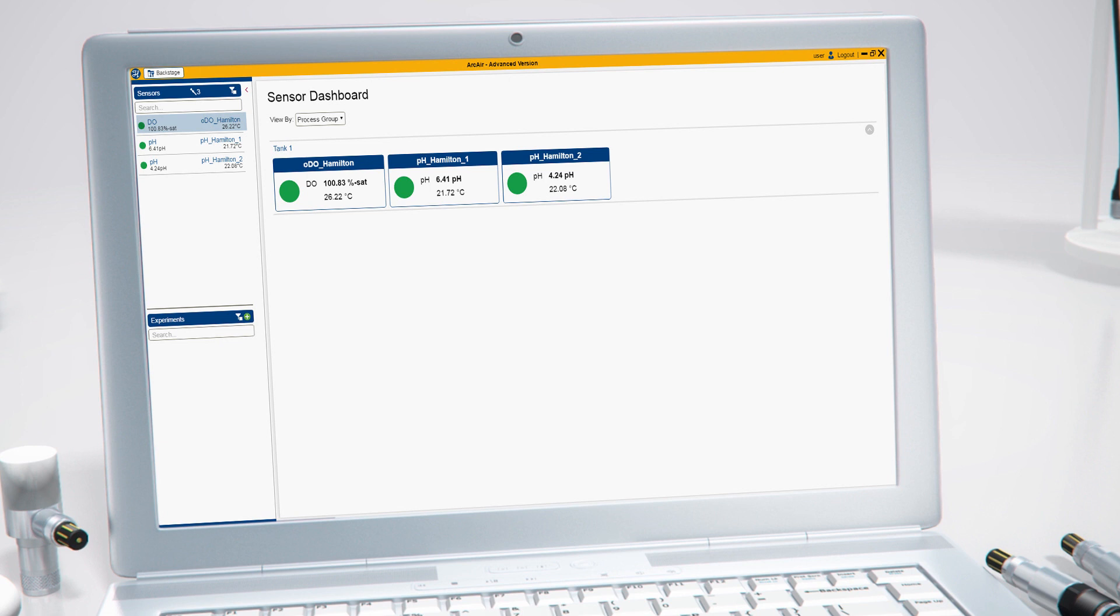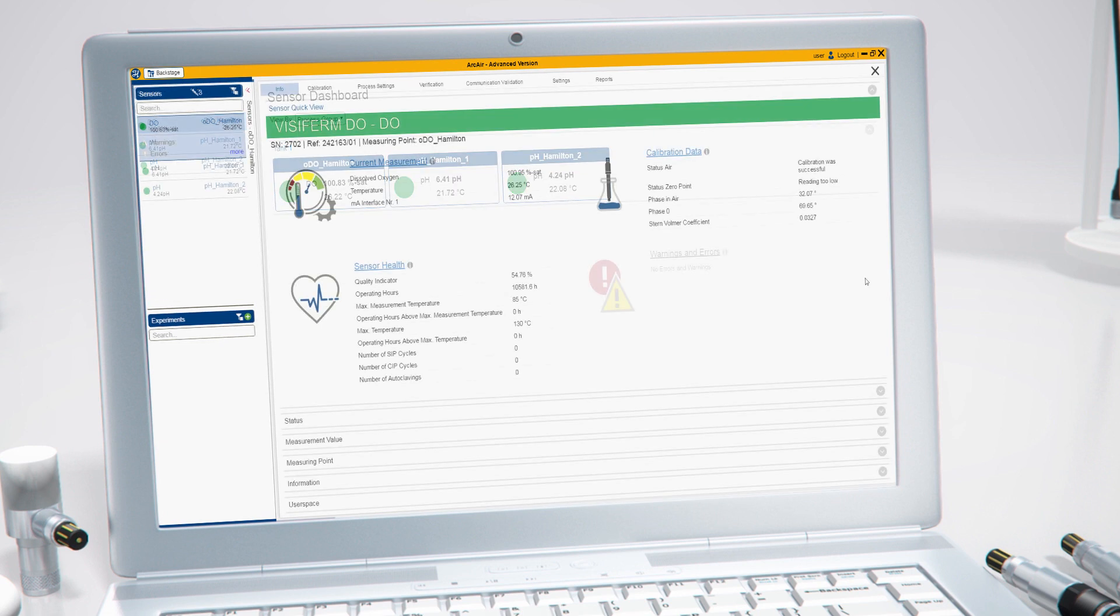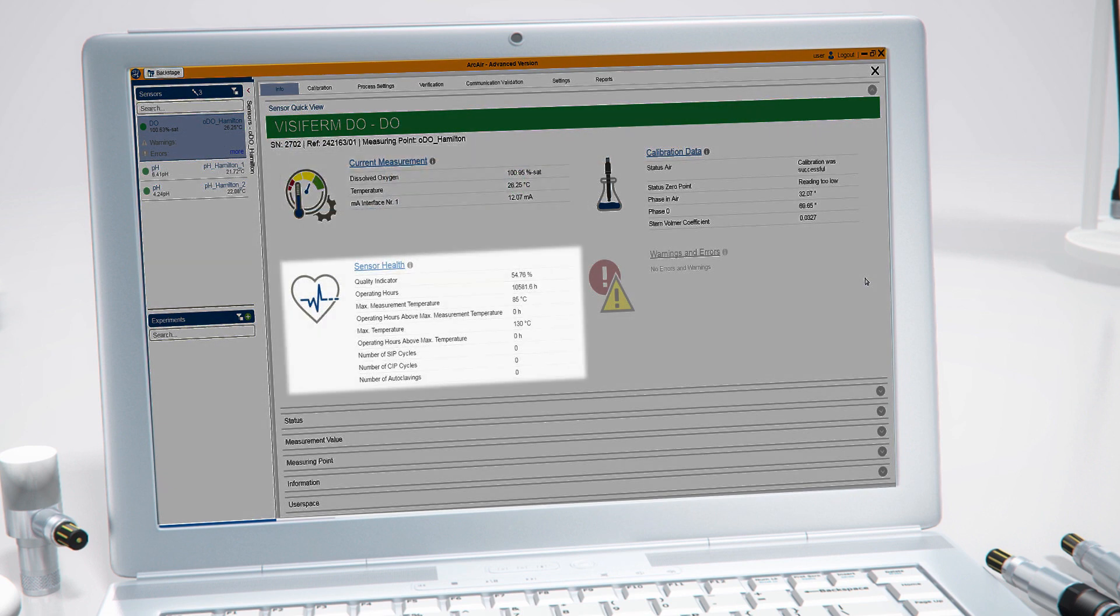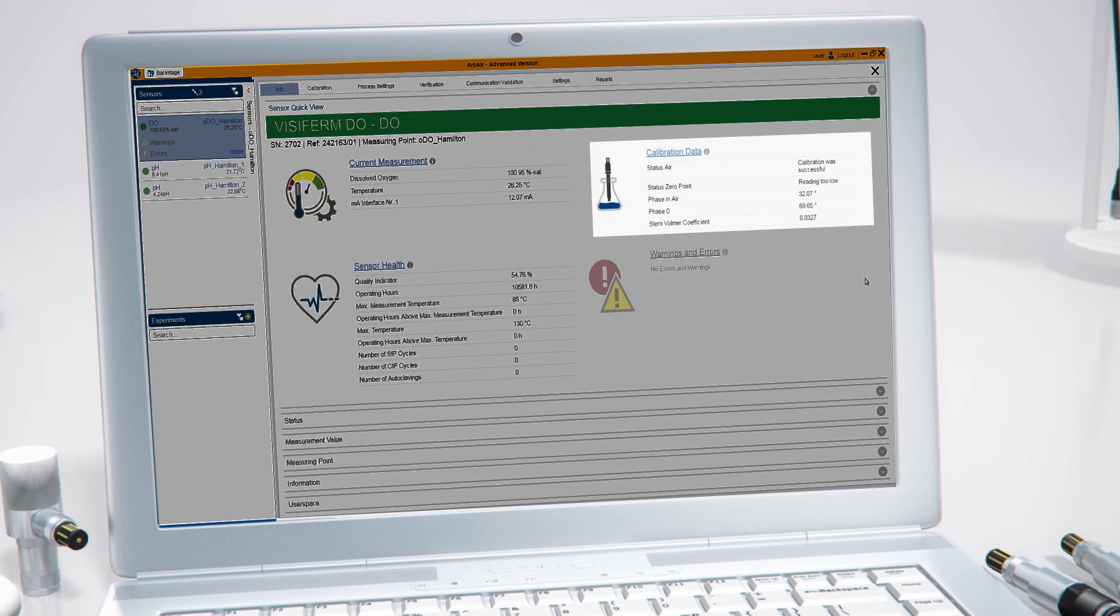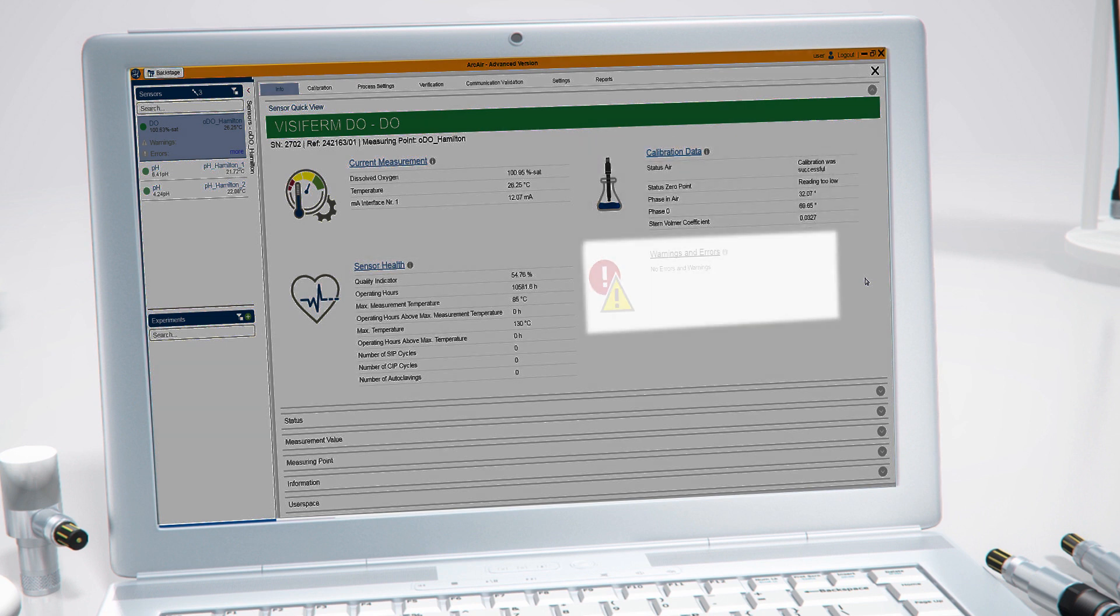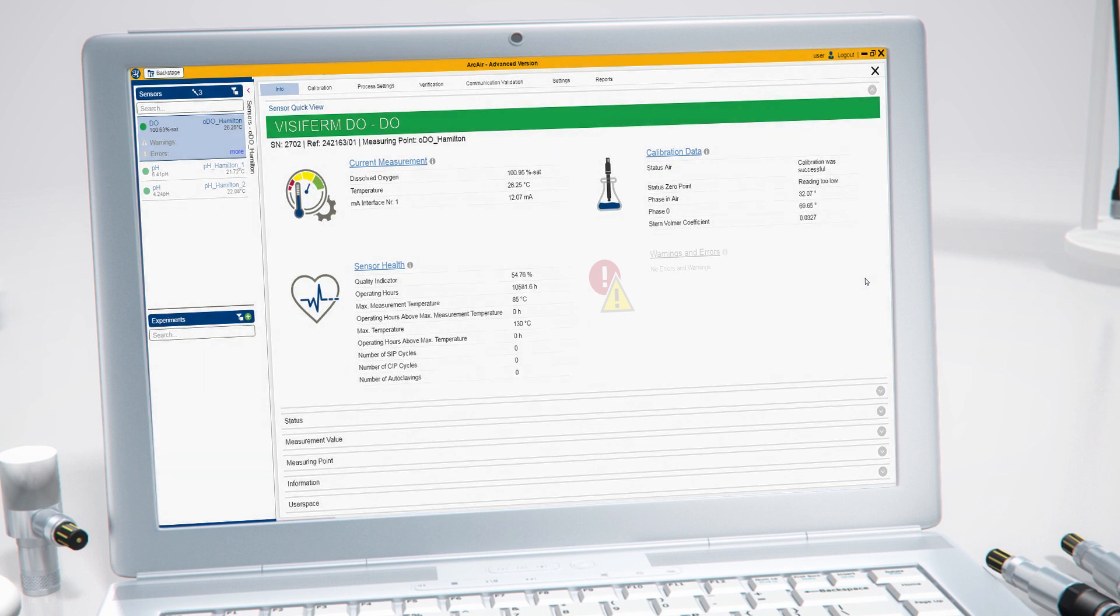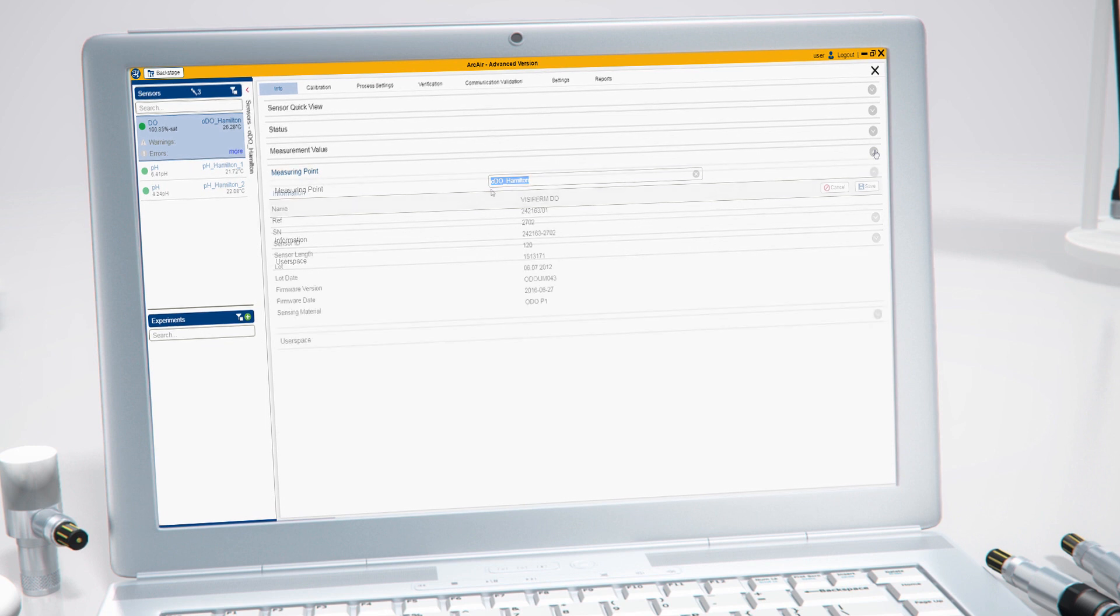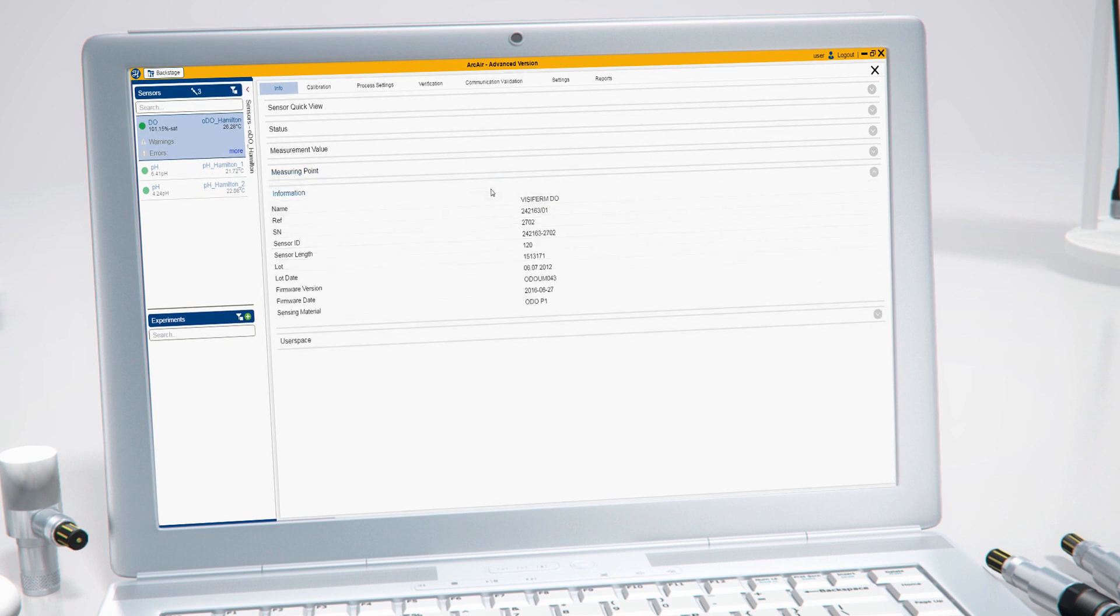Under the info tab, you can see a quick view of the most important measurement data, the sensor health and calibration data. If there are any errors or warnings, you will see them here as well. To get details of all available parameters, browse the different drop-down menus below.